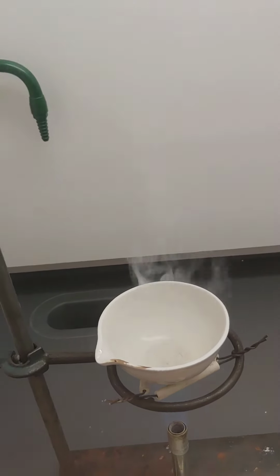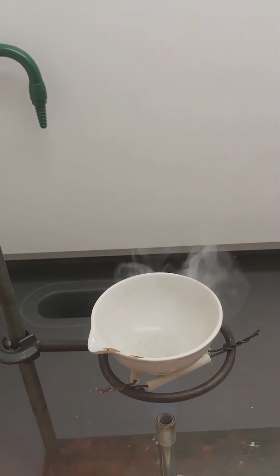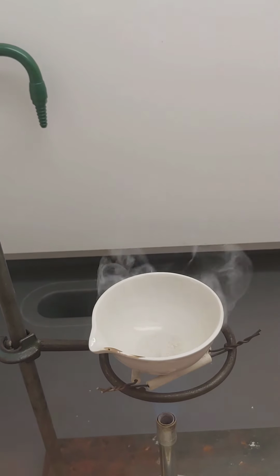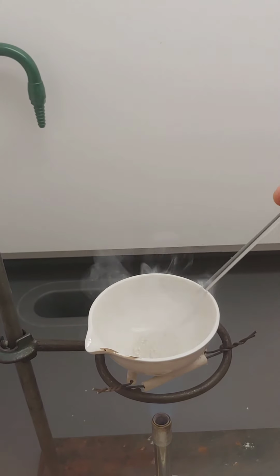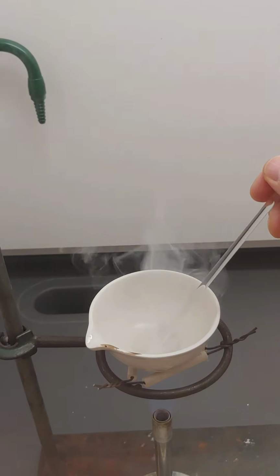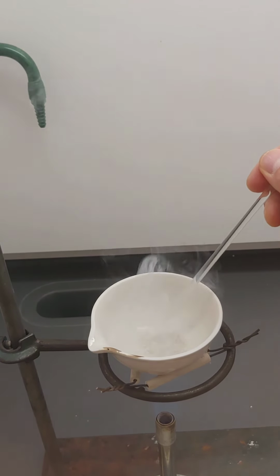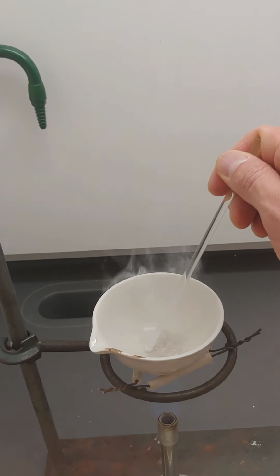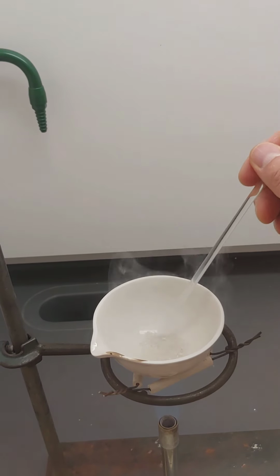So now my sample is starting to sublime off pretty well. You can see that white vapor coming up out of the dish, and that's the ammonium chloride going from the solid state right into the gaseous state. And so the important thing is that while that's occurring, I need to keep stirring this, because I need to make sure that any of that ammonium chloride that might be in there stays evenly mixed and that none of it's hiding, so that I can make sure that all of it gets out.